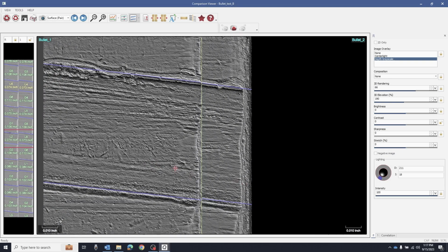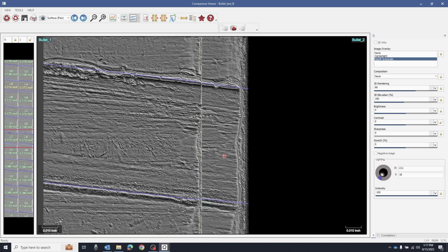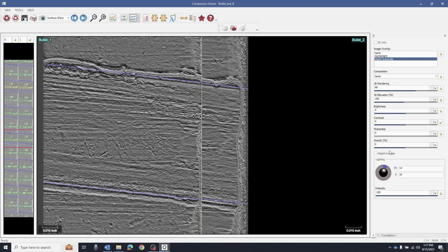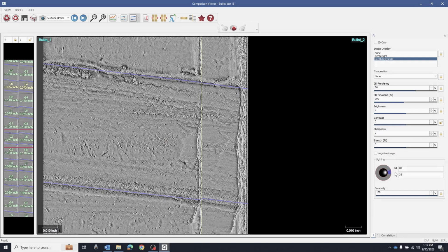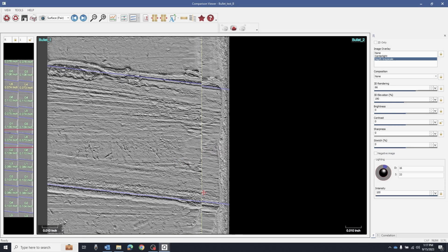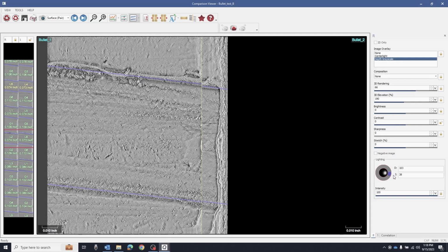I want to make sure I'm all the way, I'm right at the edge here. Play with those shadows again. See what that does for me. I like how that appears there. I can make that sort of appear or disappear depending on the light, but when it comes into view, it's reacting seemingly with something similar on the other side.